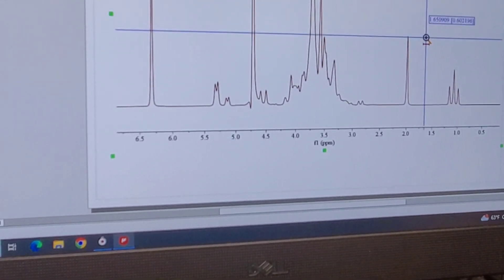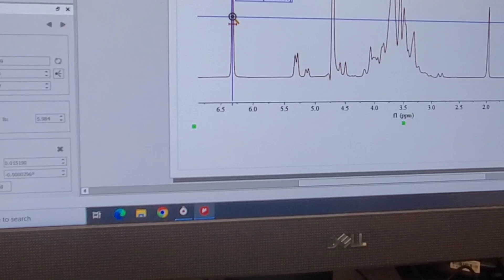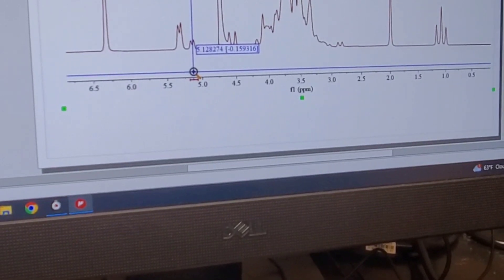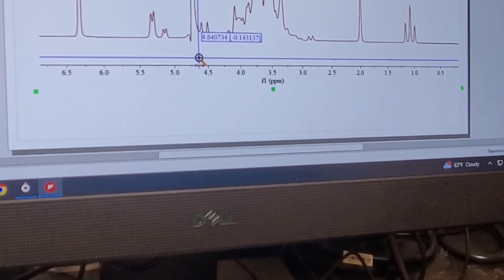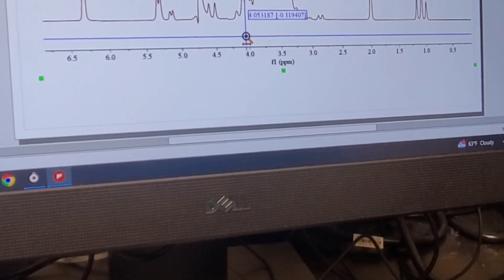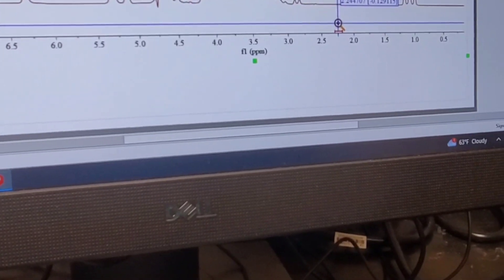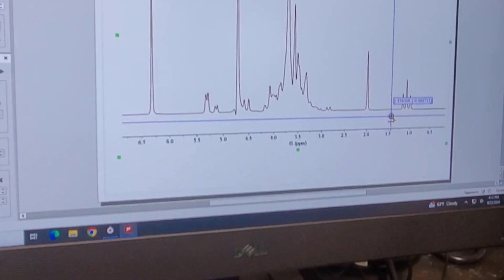As far as peak assignments go: our primary standard is maleic acid just under 6.5 ppm. In this kombucha there's a doublet just shy of 5.5 ppm — that's sucrose. Here's another doublet — that's alpha glucose, one isomer of glucose. On the side of the water peak this small doublet is beta glucose, another form of glucose. Fructose, if present, is typically in this region. Around 2 ppm is acetic acid, which adds acidity to the kombucha. And this triplet over here is the ethanol.